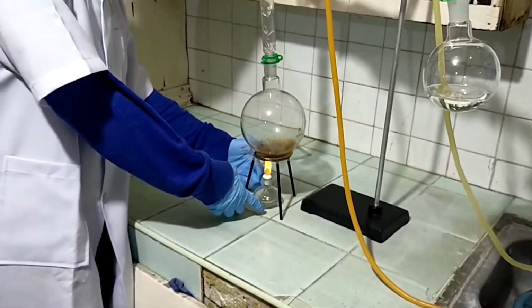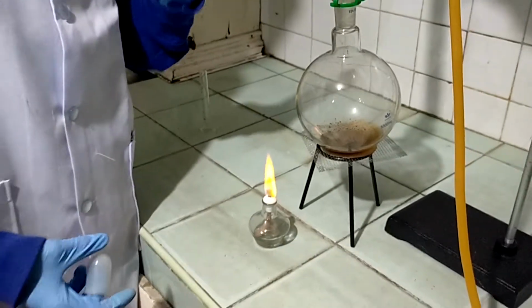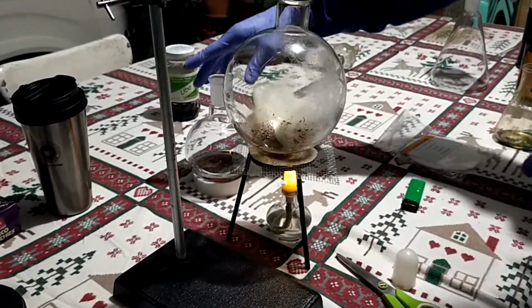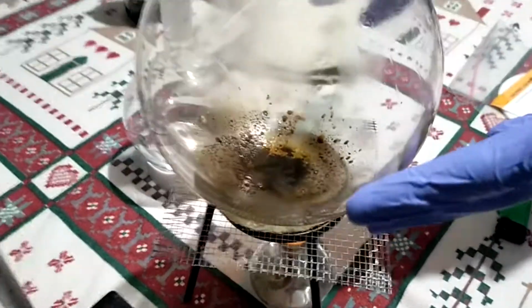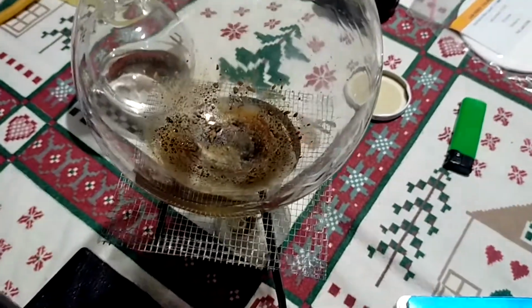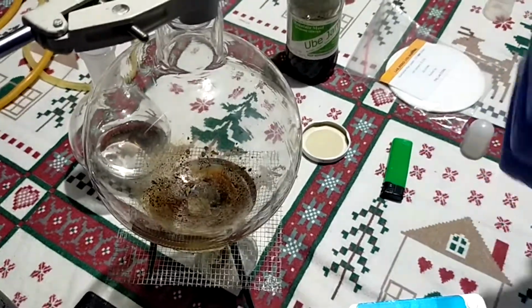So I'll remove this now. Remove the heat source carefully. And then I'm going to slowly dismantle my distilling set. Okay, so we have now safely distilled the ethyl acetate, and we now have this caffeine. I'm just going to be heating it once more because there's still some leftover ethyl acetate within the flask. Okay, now that the liquid is gone, we're going to weigh this now. But first, we need to cool it so as not to damage the weighing scale.